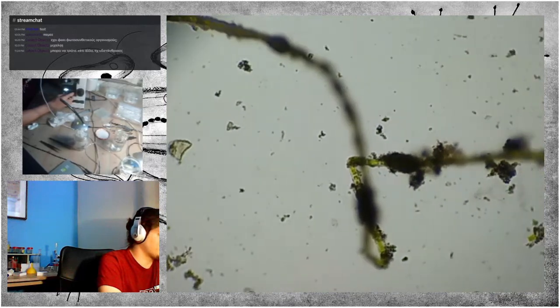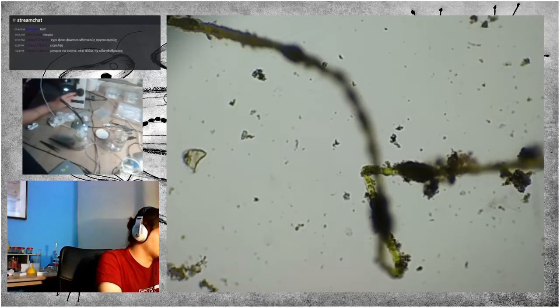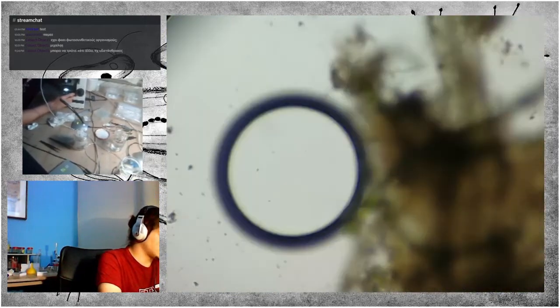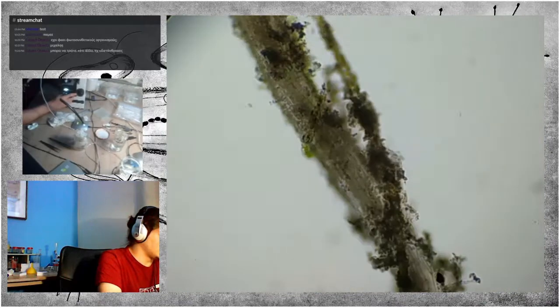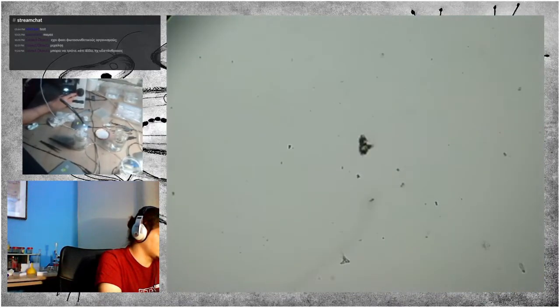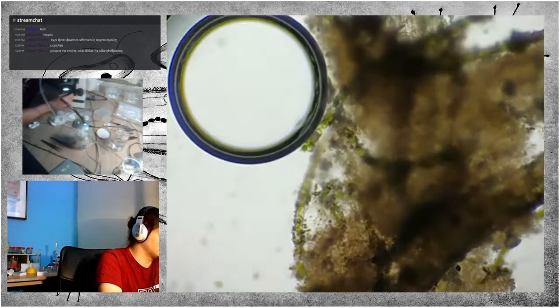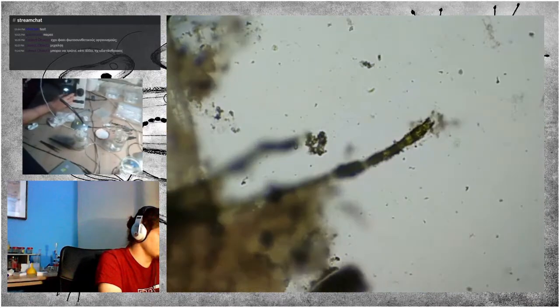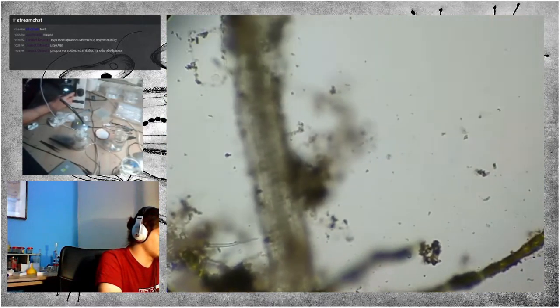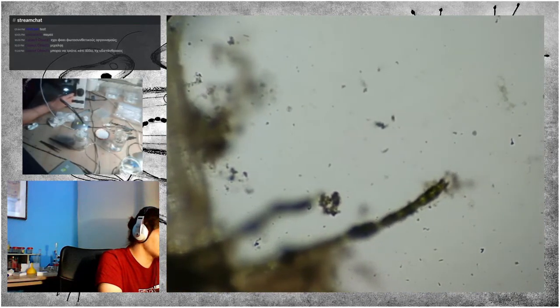But yeah. Now what? We're closing in on 2 hours, so I won't be changing slides. But I'll keep looking for a bit, and then in about 10 minutes or so, I'll be closing. Yeah, so you can see loads of diatoms. For example, here is an interesting one.